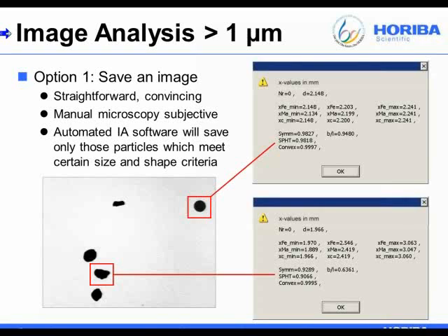So that's a very easy way of proving to your internal stakeholders if you have these large particles, or if all your large particles have a certain aspect ratio. Let's say all your large particles are needle-shaped or are cubic-shaped. Very easy, convenient way of showing that. Again, seeing is believing. There's very few arguments that are sustained after seeing an image of the particle.